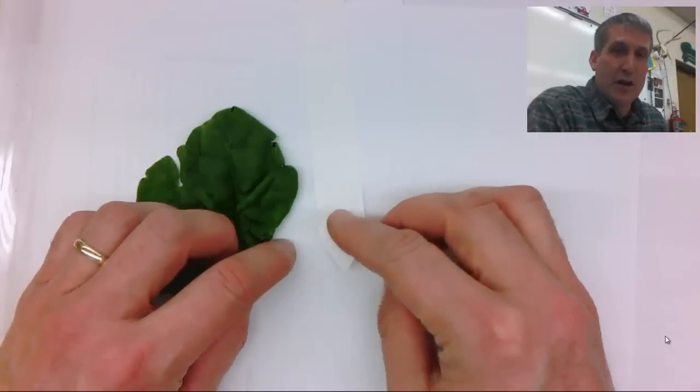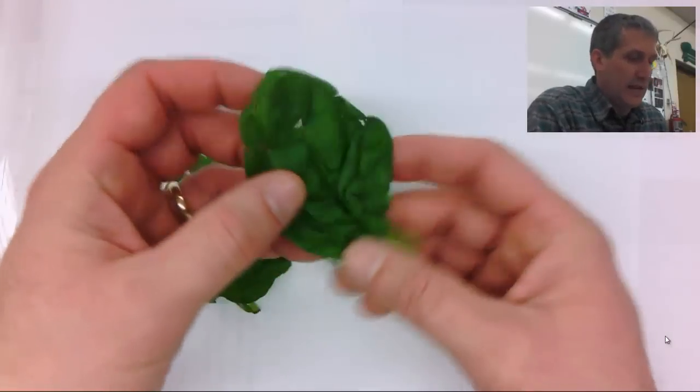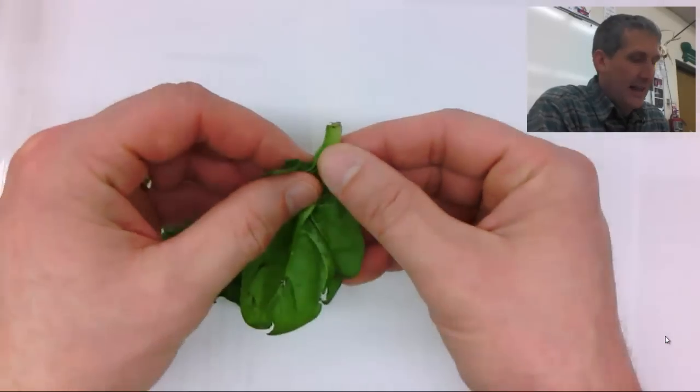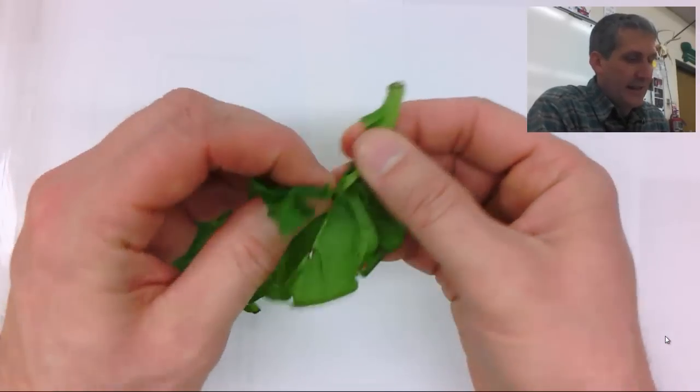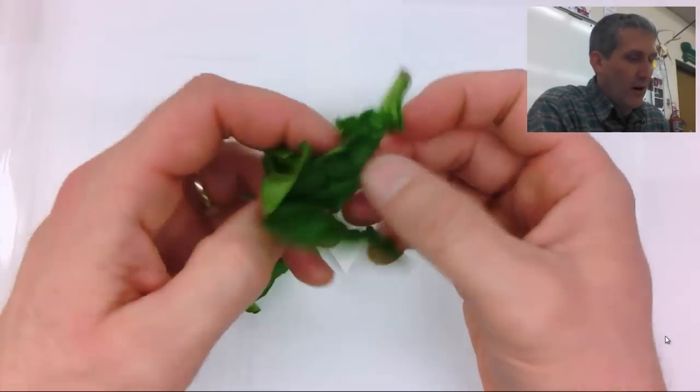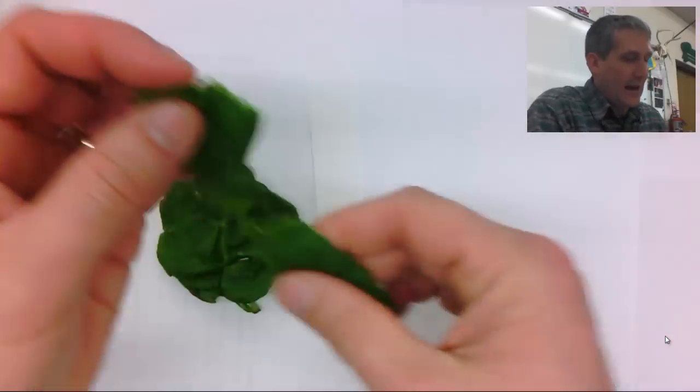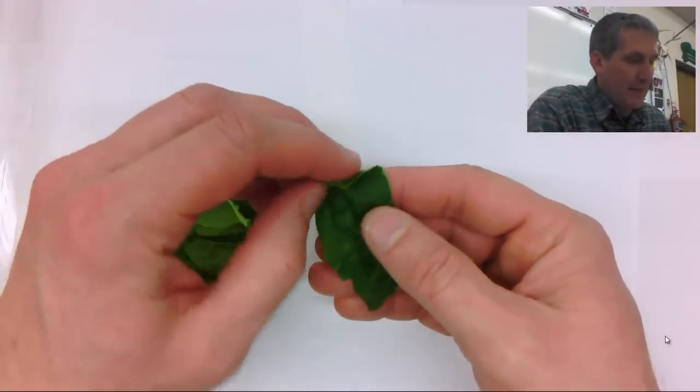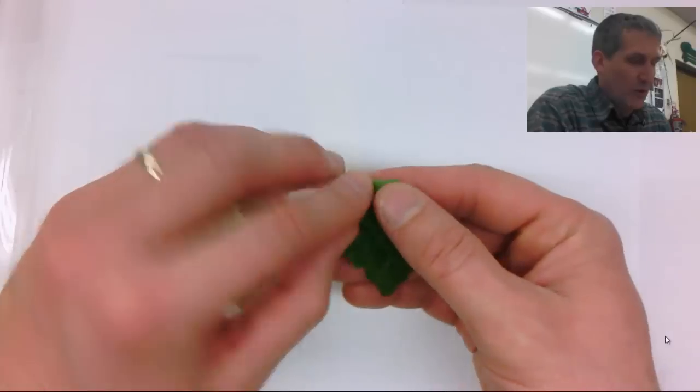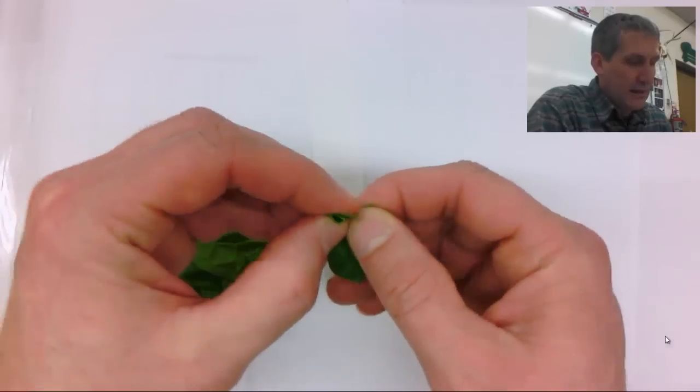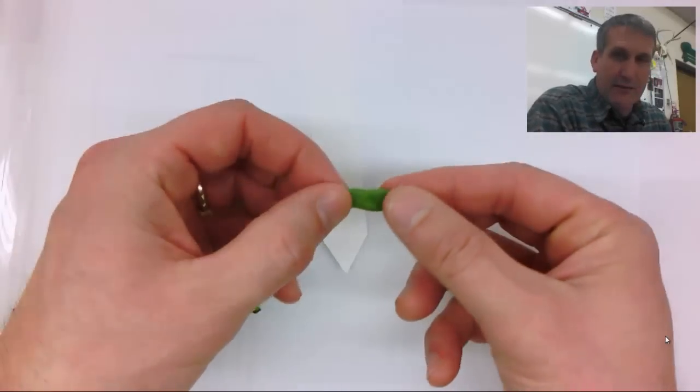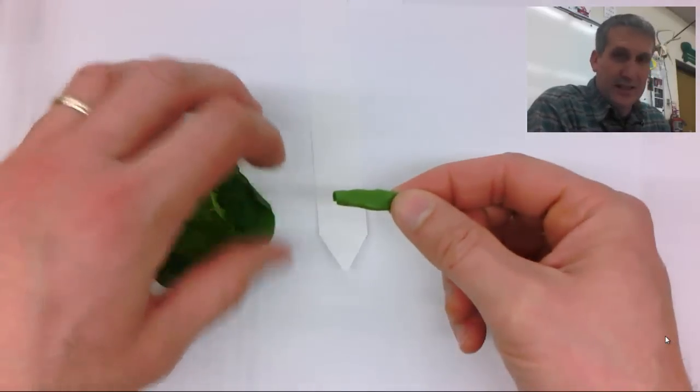So the best way to transfer the right amount is to take your spinach leaves. I like to take a little bit off, take the main veins in the middle off, makes it a little easier to work with. And I work with smaller pieces at a time. I take a little piece and kind of roll it a little bit so I have a narrower smaller piece that's easier to control.